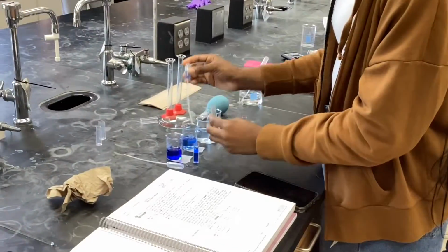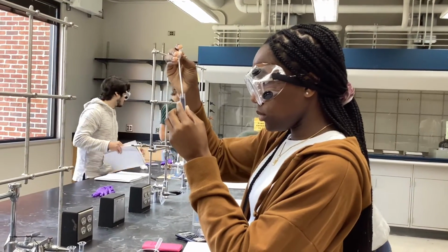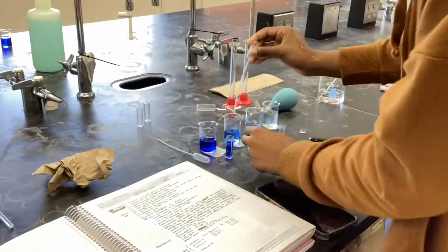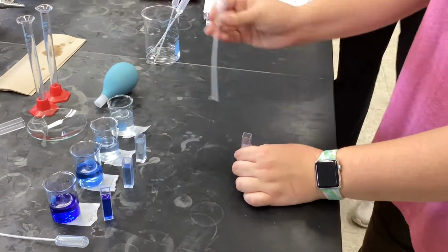In the beginning of the video, we are moving our stock, dilutions, our blank, and the unknowns into the cuvettes. We are putting it just up to the line and making sure it is not overfilled. Shown here is dilution 1. We did stock off camera. Shown here is dilution 3. We did dilution 2 off camera.